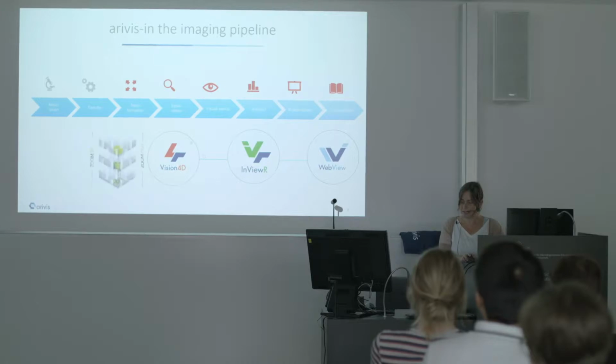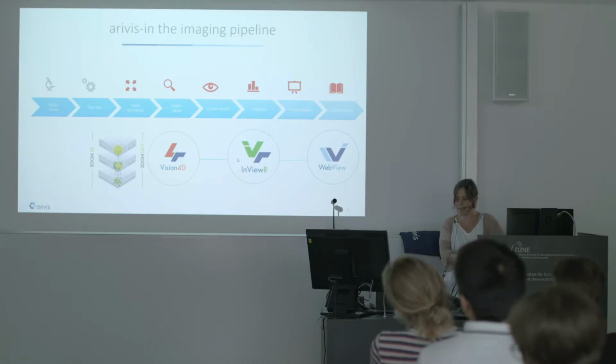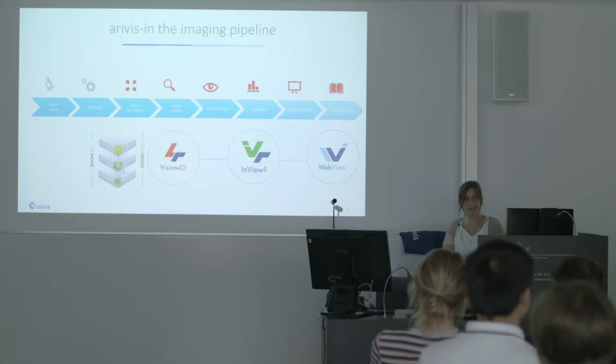So you see here the logos of our 3 software lines, software products, which are combined as a platform. And they are based on our, what we call ARIVIS core technology. When we do the hands-on sessions, we will give you much more information about that, because this is one of the crucial concepts of our software.